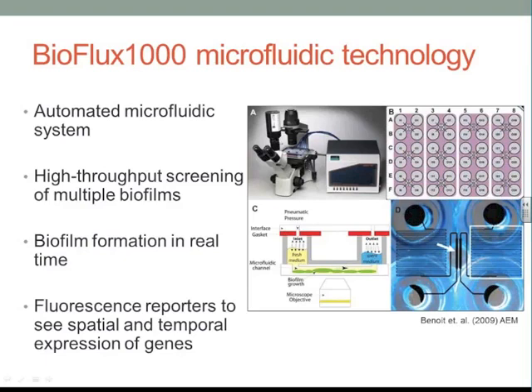In panel B here, it's just a basic cartoon schematic of a 48-well plate. And on the left side, you have all of the input inlet wells where we add your fresh media, and then your output or effluent waste wells, where you would flow the media across the cells in this little viewing region here. And panel D correlates to that small viewing region, where you can see these tiny channels, and then the viewing port here, where your biofilms would have their images taken.